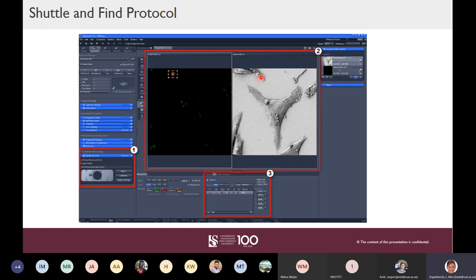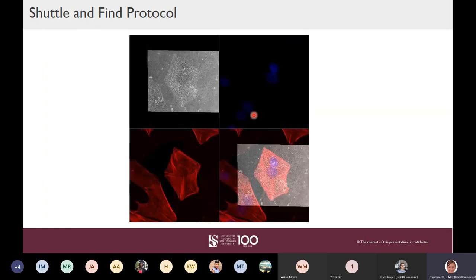Zen also offers correlation overlay of the images. You identify typically three fiducial marker beads visible on both images, tell the software they are the same points, and it overlays them. Here's an example: our fluorescence image had blue and red channels, and after the shuttle-and-find overlay the software creates one more channel — the electron microscope channel — and you can then overlay or remove colors as needed.